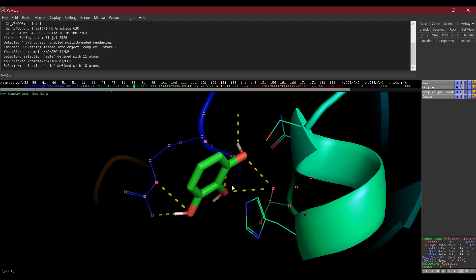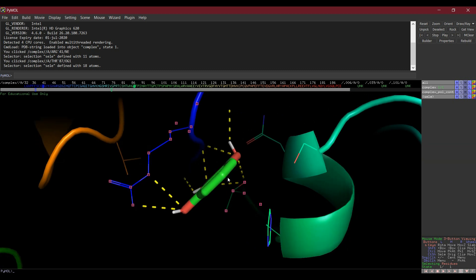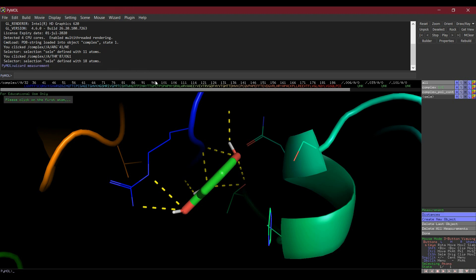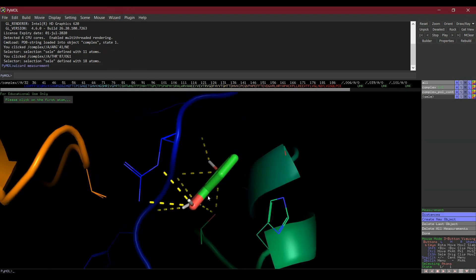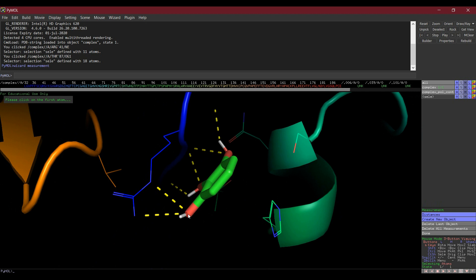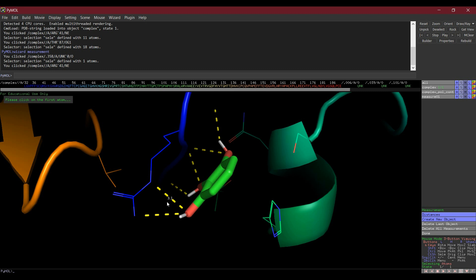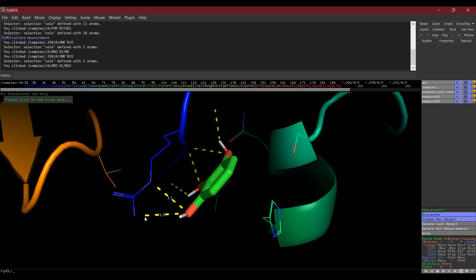We can also measure the bond length. From Wizard, select Measurement, then click on one atom and then the other — this will show you the bond length. In this fashion you can calculate the bond lengths of all these interactions.